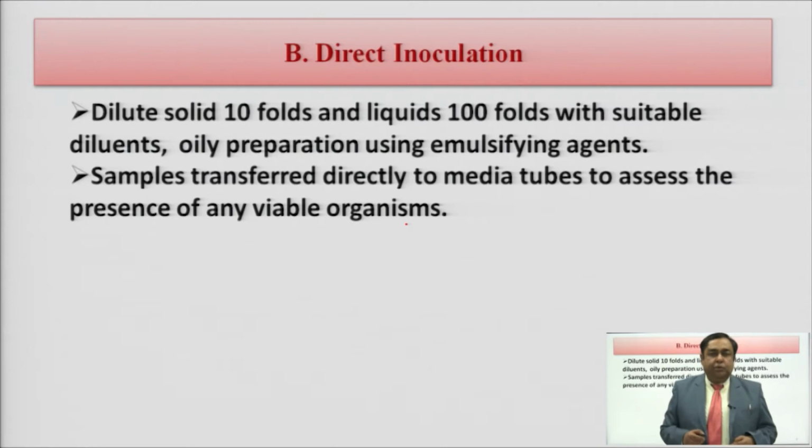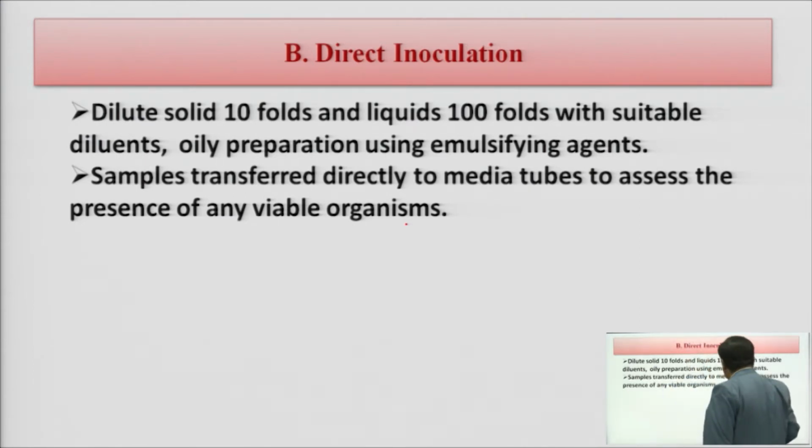You have to take the help of an emulsifying agent if the preparation is water insoluble. Particularly, we are talking of the oily preparation, where we need to add an emulsifying agent and then put it directly into the medium.